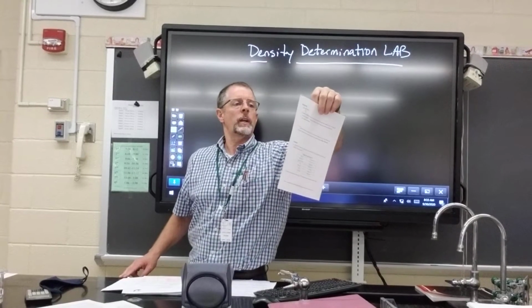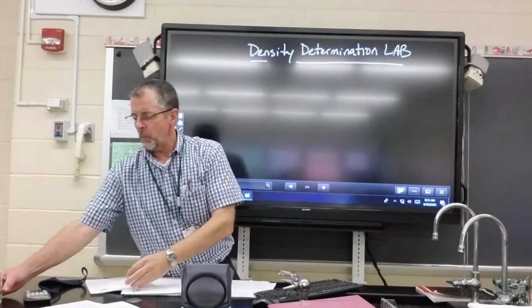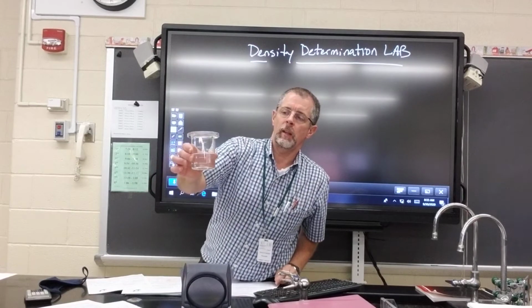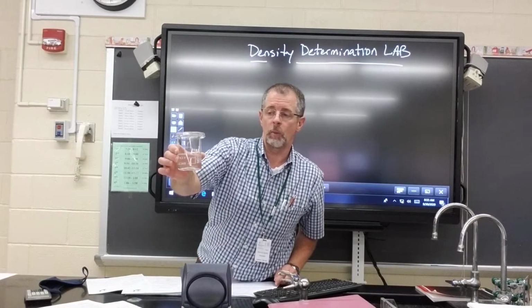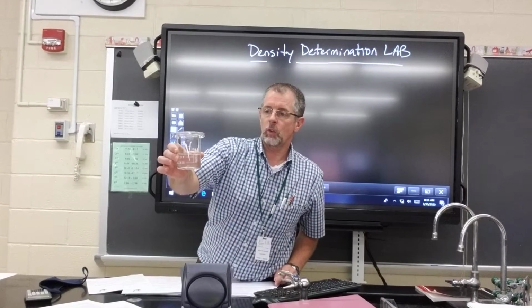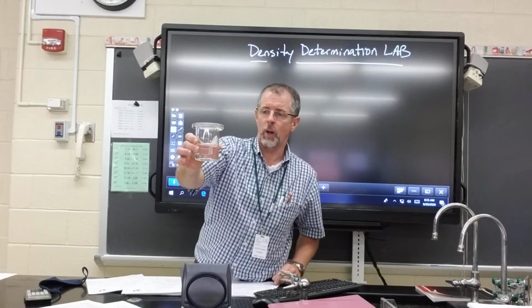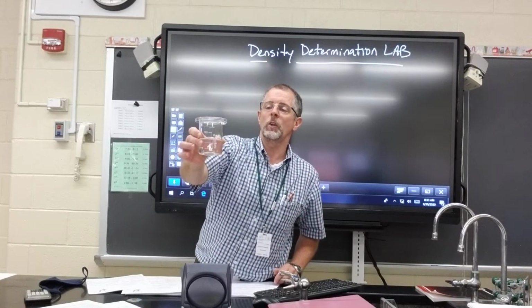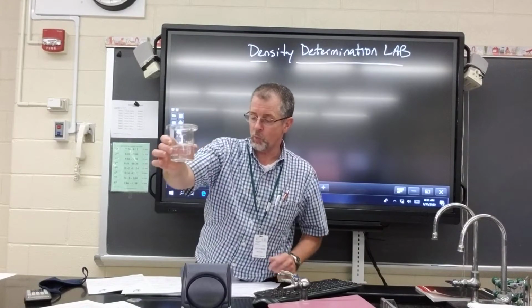So the first thing, what is the purpose of this lab? In this lab, we're going to be taking a clear liquid, and you have to use density to determine what that liquid is. So for example, if I were going to give you this and say, here, drink this, it's water, but you know I'm trying to poison you, you want to do a density to determine if it actually is in fact water.